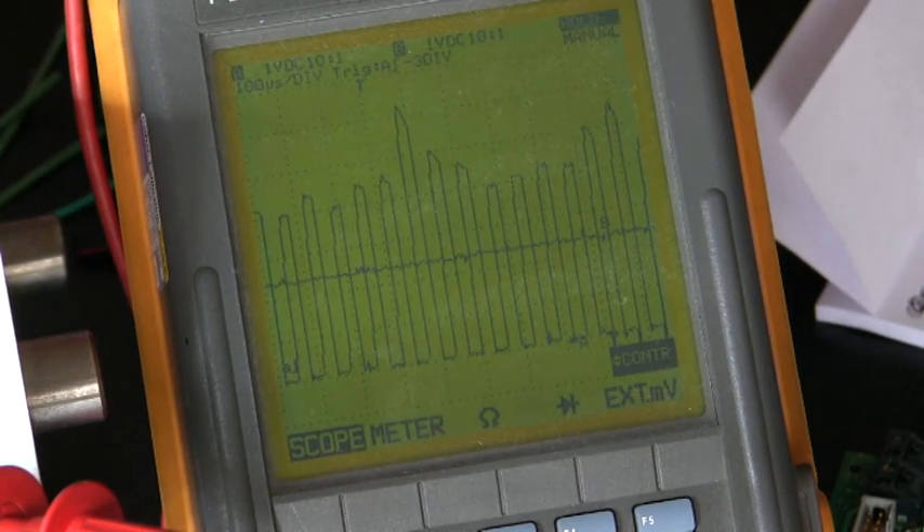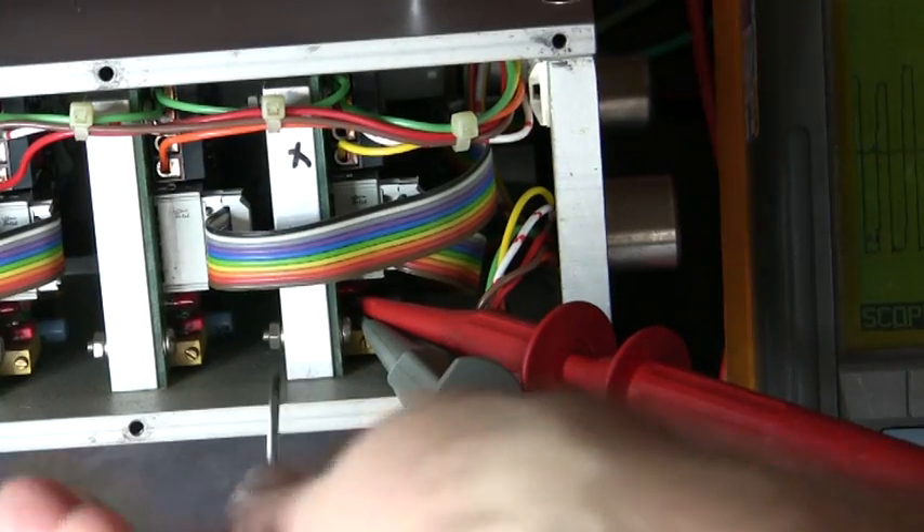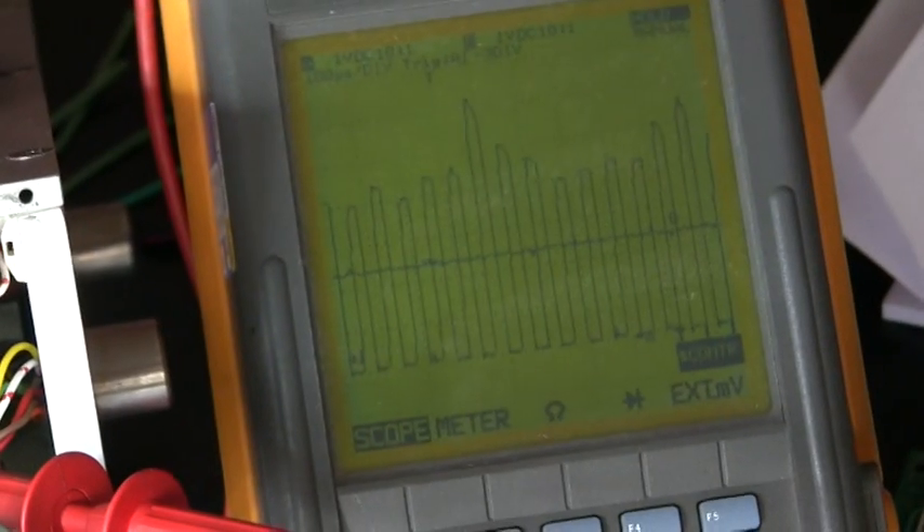The adjustment potentiometer is just underneath the probes. You can just see a little screw here. I'm going to turn that and then you can have a look at the scope and see what happens.